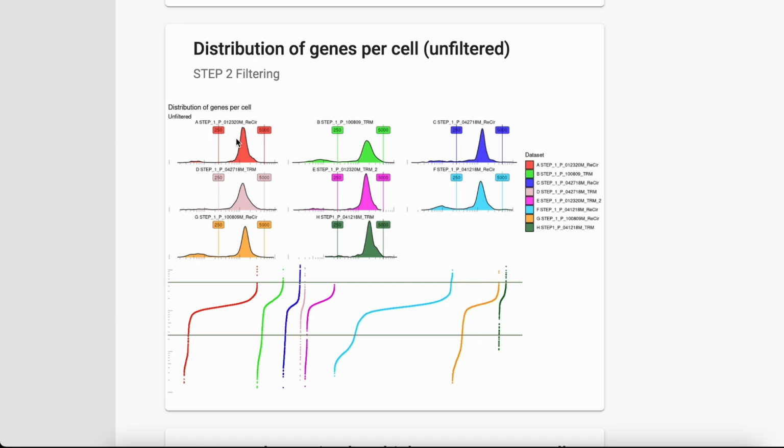And the maximum number of genes per cell was set as 5000. It also seems that this characteristic was set too relaxed, so we could make it more stringent, maybe 3500, or try 4000 first and see if that would cut enough of the outlier population.